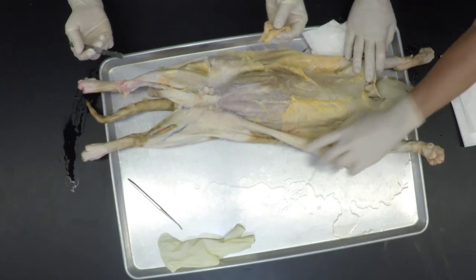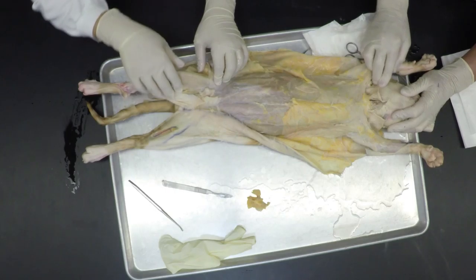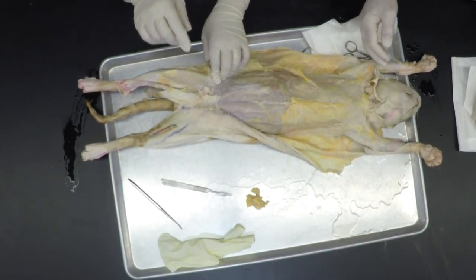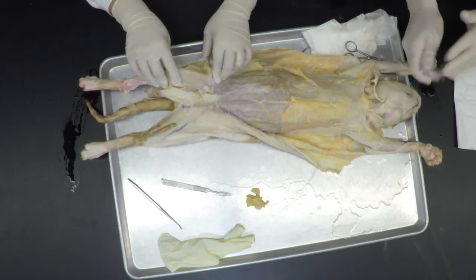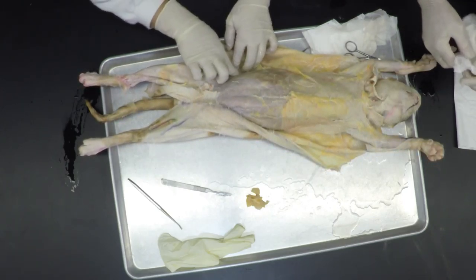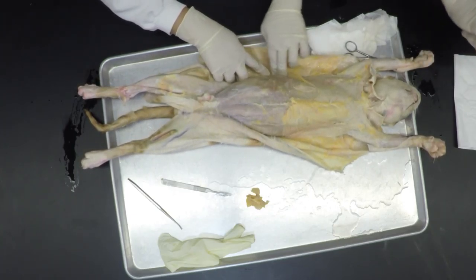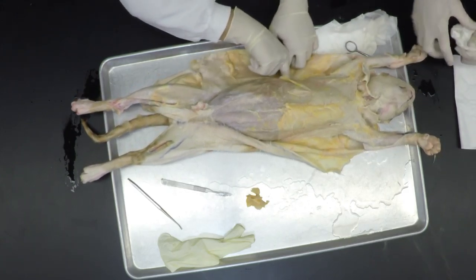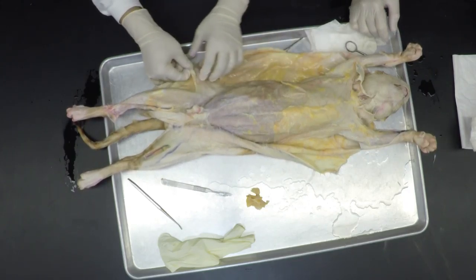Pieces of the body, like the fat or other pieces that we take, we put in the biohazard trash can, which is red and is in the corner of your lab. Nothing goes to the sink. When you finish working with your cat, you have to keep everything clean and put it back the way you found it.